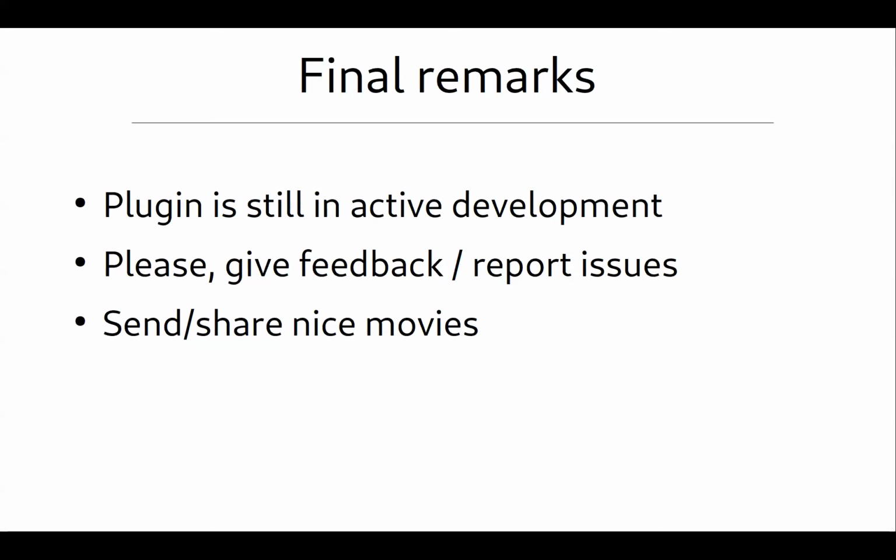We are done. Final remarks. The plugin is version 8, so it's still in active development. I think the main things are there, but since it's in active development, there will be a lot of bugs. Please be patient and forgiving about it. From now on, it will only improve, hopefully. I realize how many things need to be improved there, and hopefully they will be.